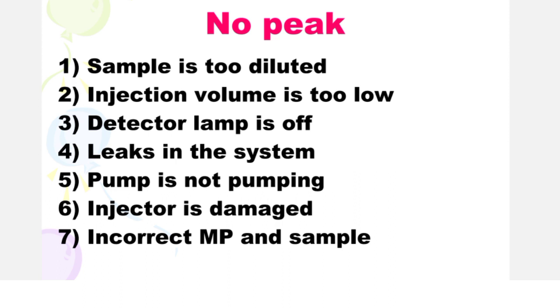Friends, sometimes you have observed there is no peak at all in your analysis. No peak is due to the following reasons: sample is too diluted, injection volume is too low, detector lamp is off, leaks in the system, pump is not pumping, injector is damaged, and incorrect mobile phase and sample.